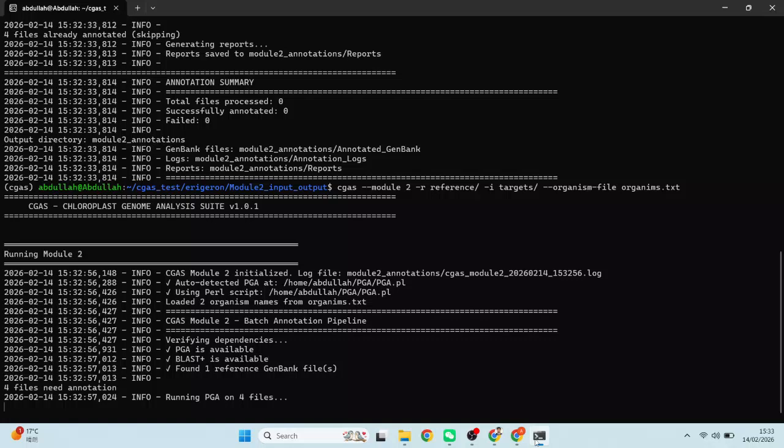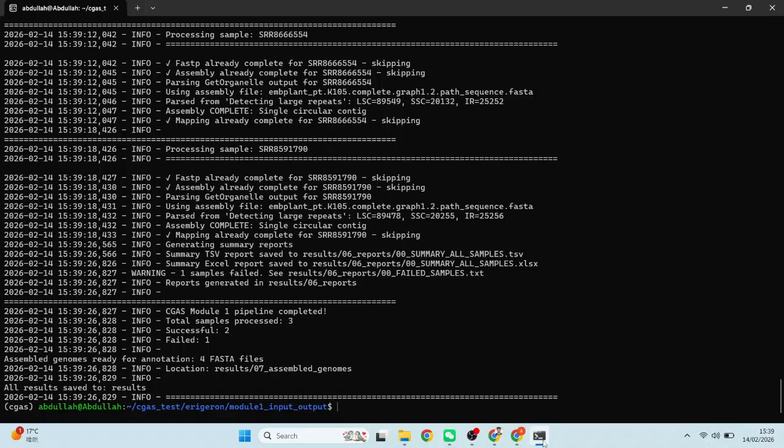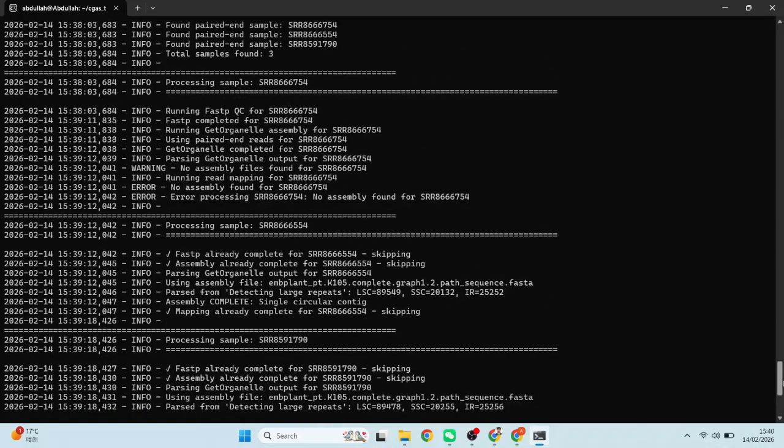Now we will run module 1 for GetOrganelle. First I will show you that GetOrganelle is not providing any good result. Just see, this is not providing any result to us.